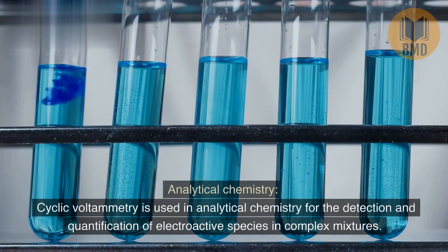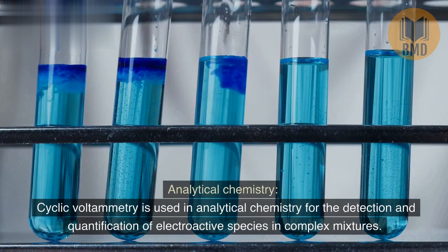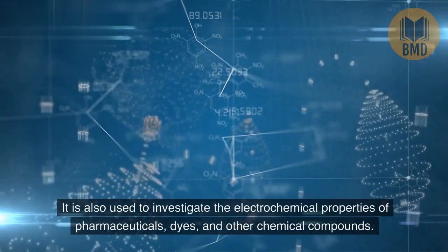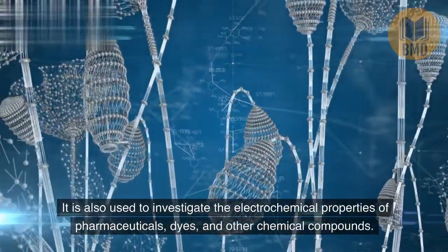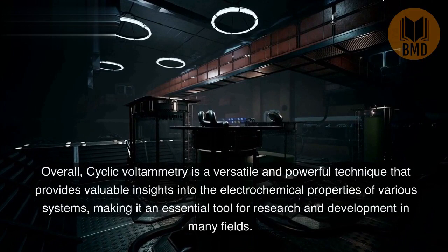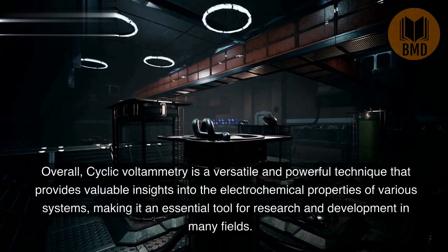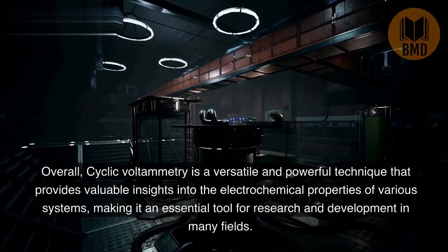Analytical chemistry. Cyclic voltammetry is used in analytical chemistry for the detection and quantification of electroactive species in complex mixtures. It is also used to investigate the electrochemical properties of pharmaceuticals, dyes, and other chemical compounds. Overall, cyclic voltammetry is a versatile and powerful technique that provides valuable insights into the electrochemical properties of various systems, making it an essential tool for research and development in many fields.